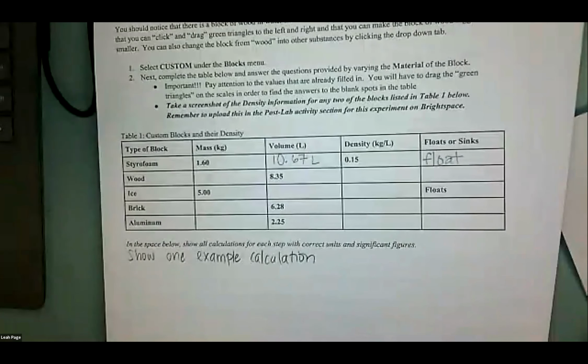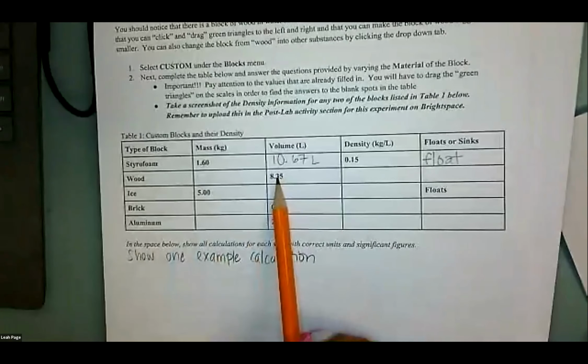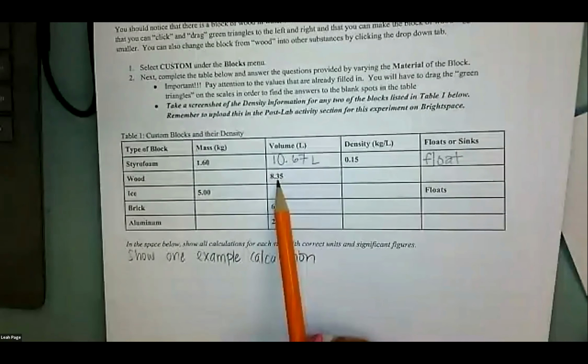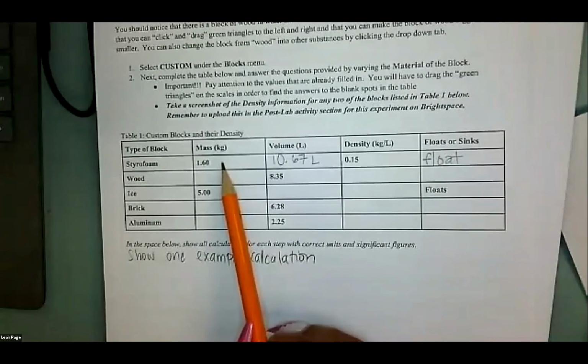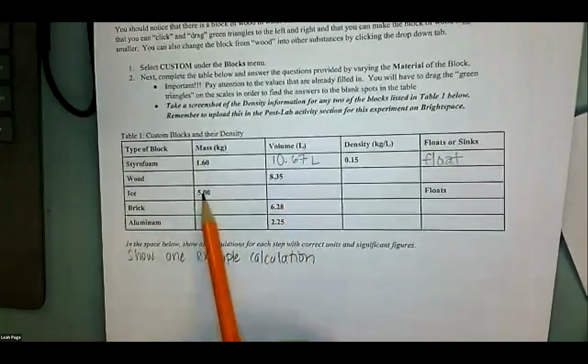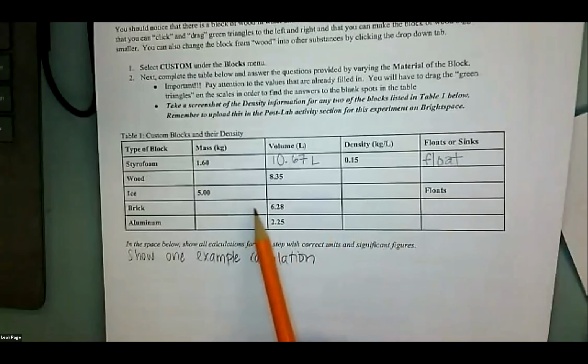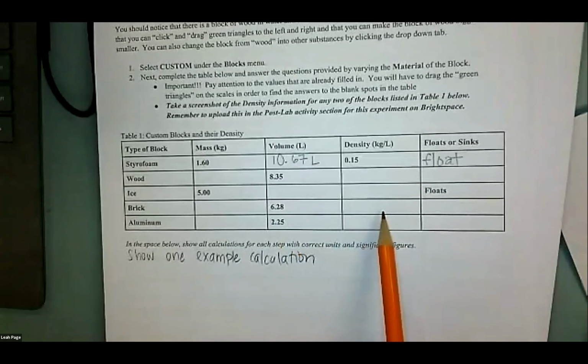How will we get the mass for wood? They give you the volume, and you change the volume instead of changing the mass. For the styrofoam, we changed the mass, and then we calculate. You see what I mean? Okay, so basically you just have to pay attention to the numbers that are already given to you and then figure out the other numbers.